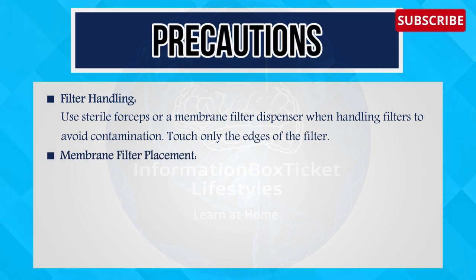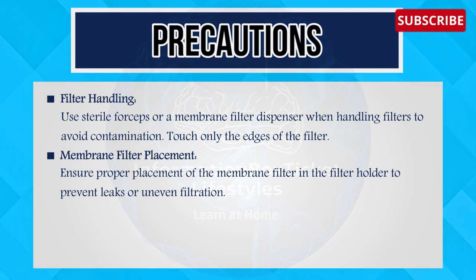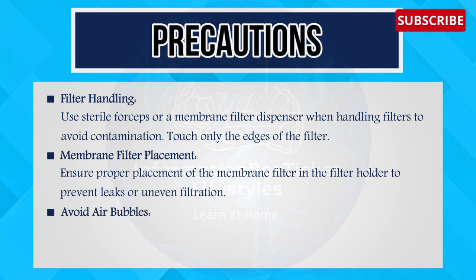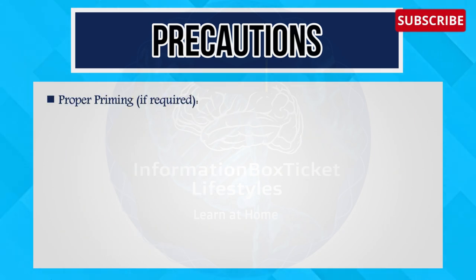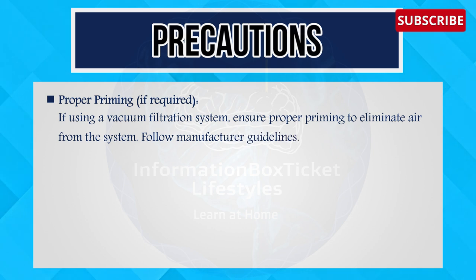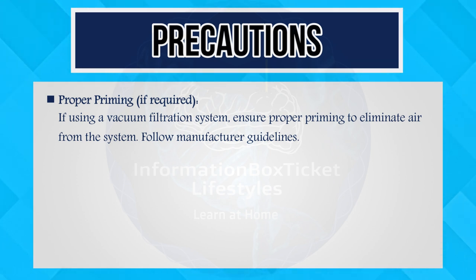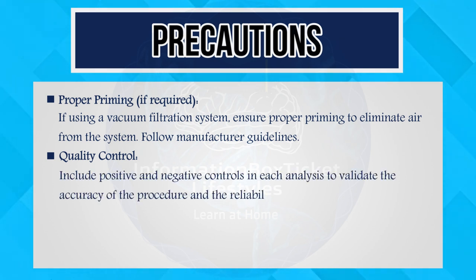Sixth, Membrane Filter Placement — ensure proper placement of the membrane filter in the filter holder to prevent leaks or uneven filtration. Seventh, Avoid Air Bubbles — minimize the introduction of air bubbles during sample filtration as they can impact the accuracy of colony counts. Eighth, Proper Priming — if using a vacuum filtration system, ensure proper priming to eliminate air from the system and follow the manufacturer's guidelines. Ninth, Quality Control — include positive and negative controls in each analysis to validate the accuracy of the procedure and reliability of the results.